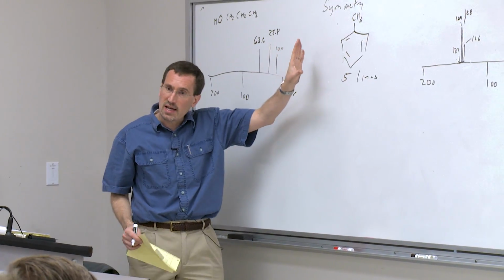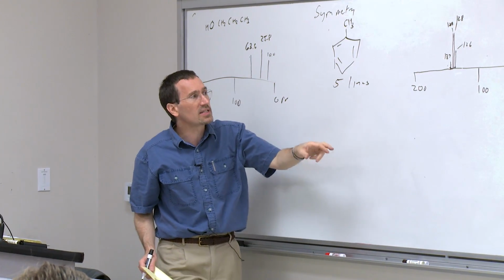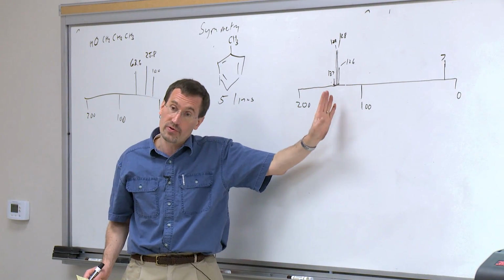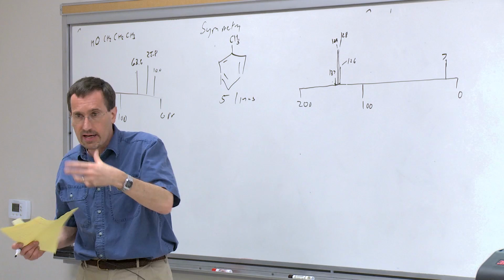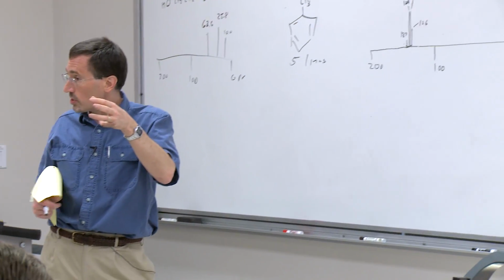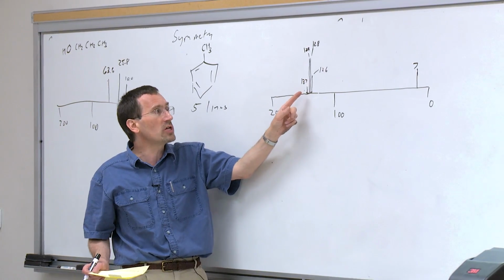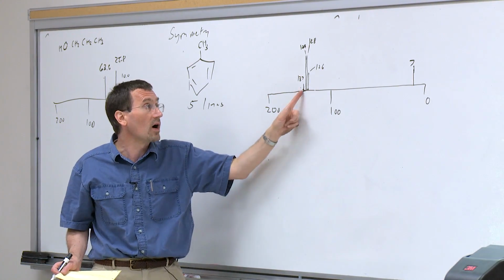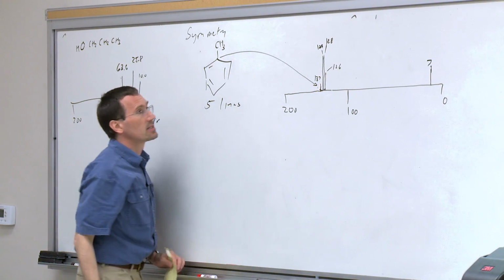So that's sort of what you'd see. So your first idea might be there are 5 unique types of carbons, but there are also little hints. Quaternary carbons are often further downfield, but also quaternary carbons, due to a variety of reasons with not having hydrogens attached to them, end up being very small. So usually when I see a really short peak, it's like, oh, that's probably a quaternary carbon. In other words, that peak corresponds to this.